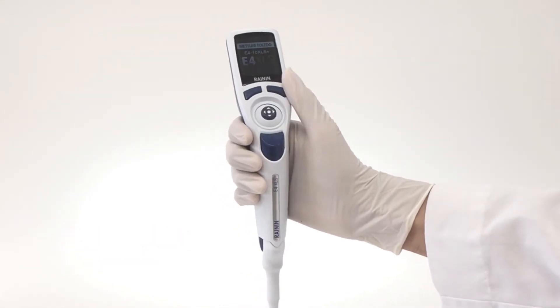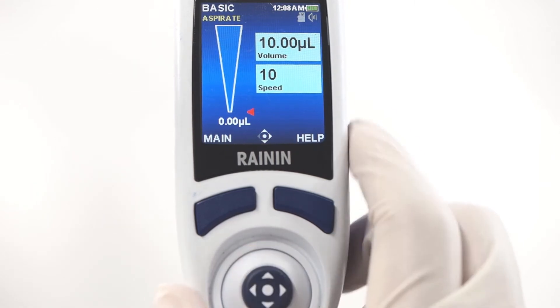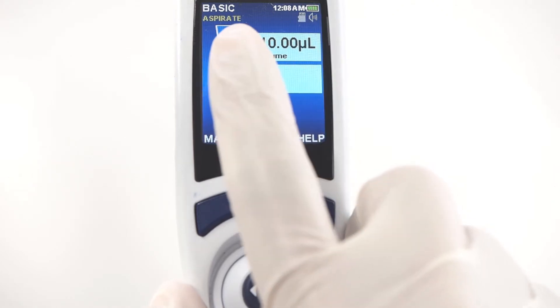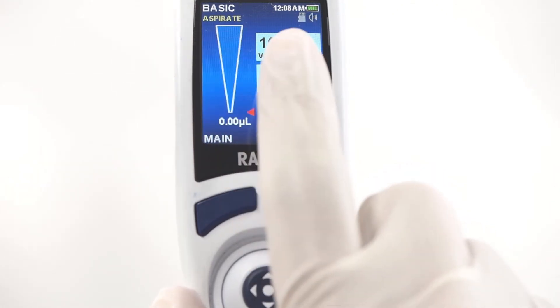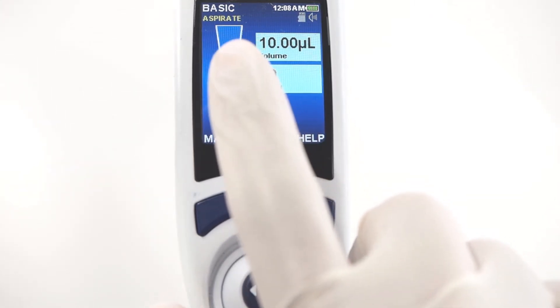Press either key to turn it on. The screen provides a clear readout of what you need to know: the pipetting mode you're in, the time and battery level, the current pipetting action, and the SD card and sound indicators are all shown at the top. On the left, a tip volume graphic displays tip volume status as you pipette.